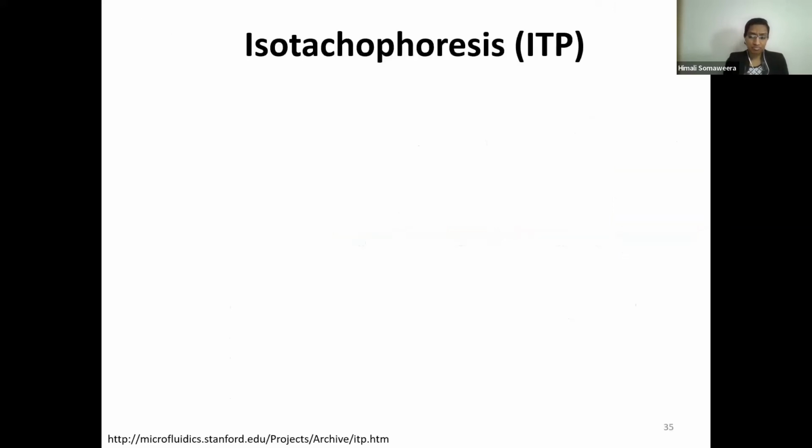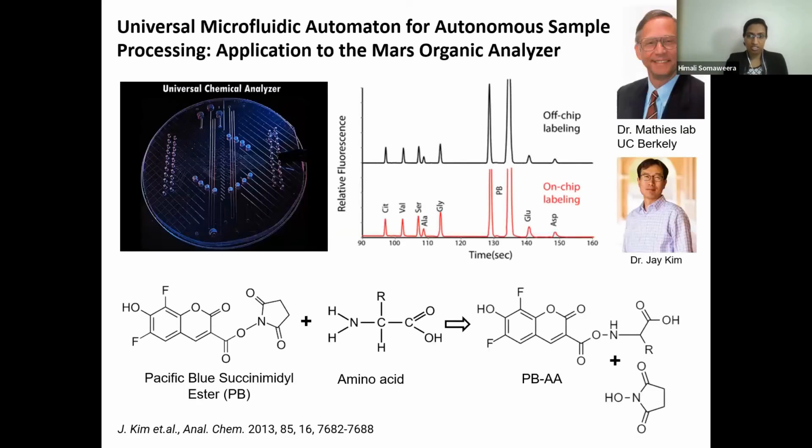But when you do such experiments, we can collect only very small or trace amounts of molecules. And when you have trace amounts of molecules or chemicals, detecting those under a microscope or any other analytical technique is more difficult, because we need at least a sufficient concentration.